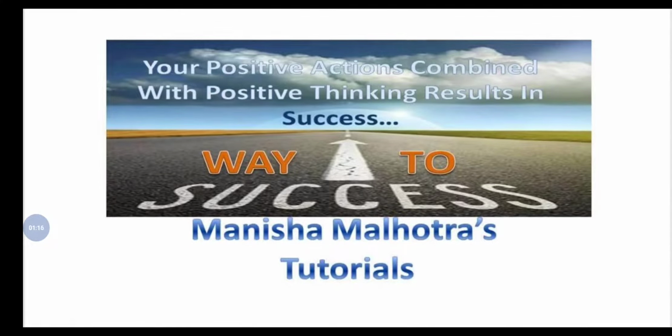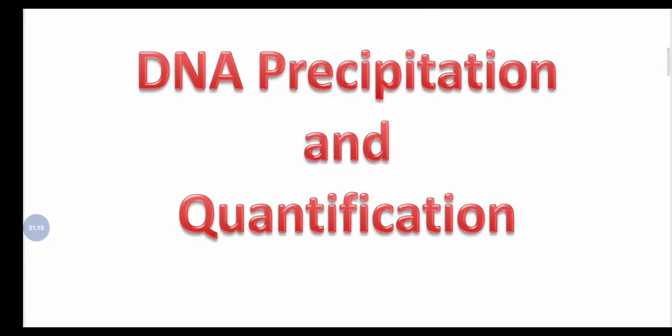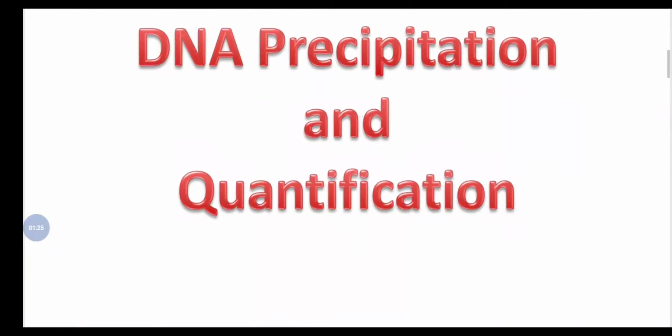So starting with that, DNA precipitation and quantification. This is the topic of our study today. Moving on.